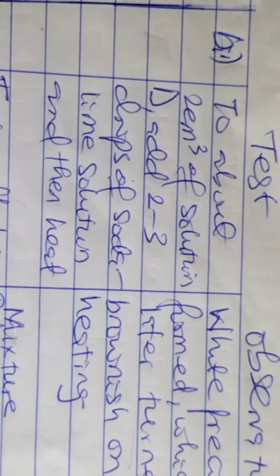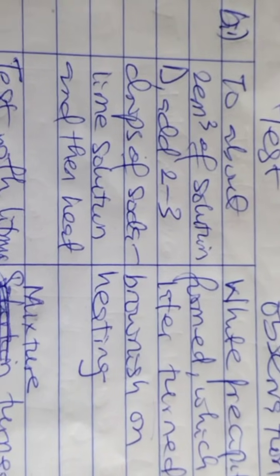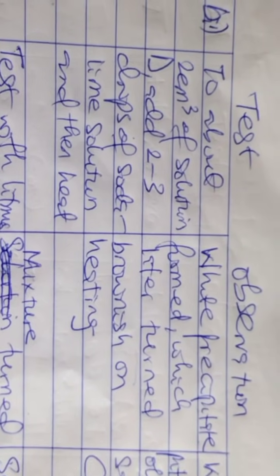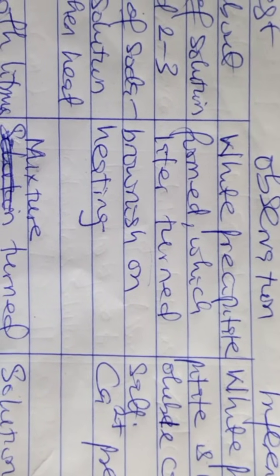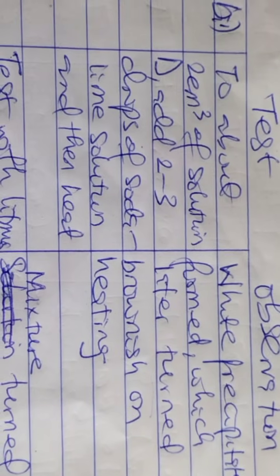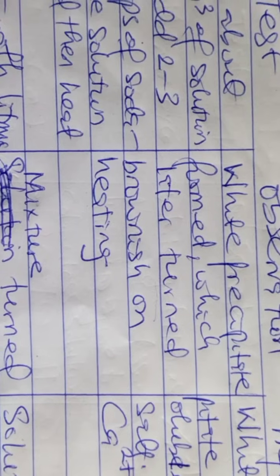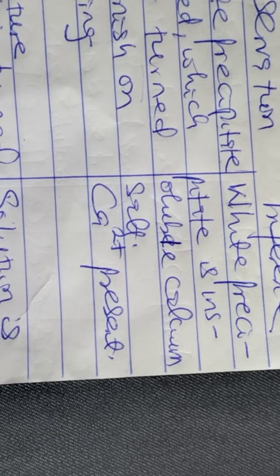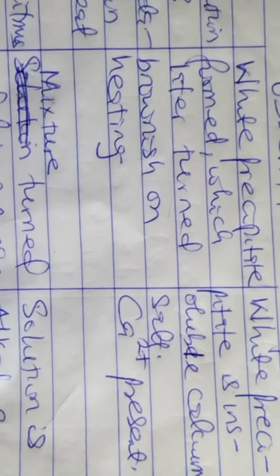We'll now go to question BI. It says to about 2 cm cubed of solution D, add 2 to 3 drops of soda lime solution and then heat. Observation, you have a white precipitate formed, which later turned brownish on heating. So this is what we call Millon's test. Then inference, white precipitate is insoluble calcium salt. So you can also say calcium 2 ion present.